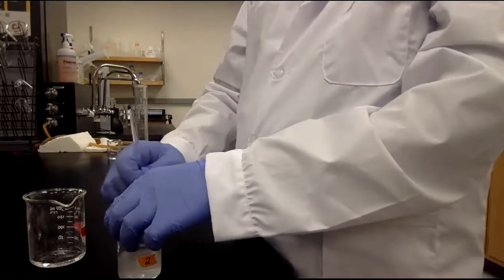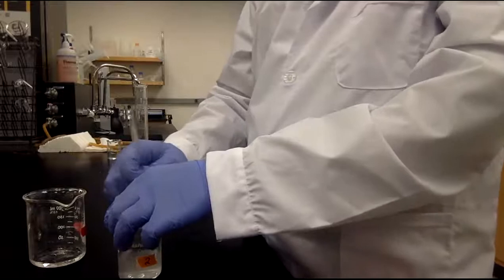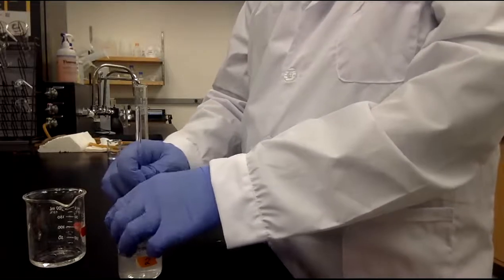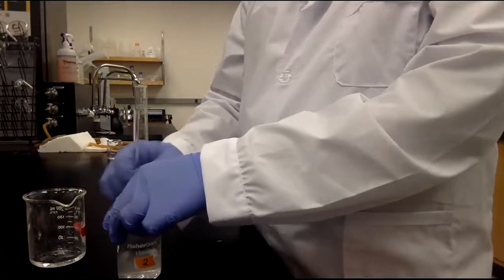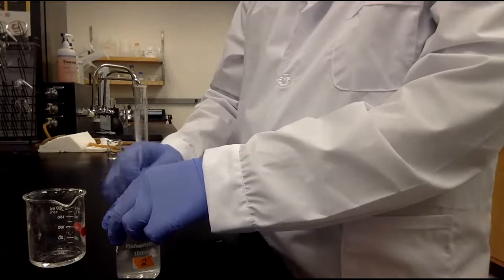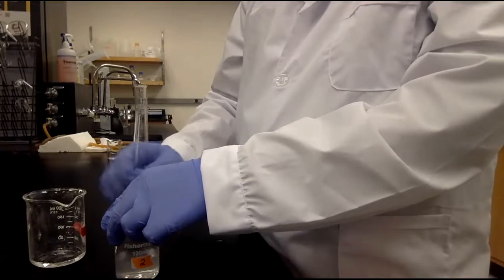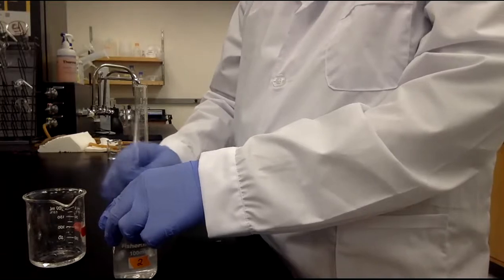You'll be done with part one in like 10 or 20 minutes, right? Because we're almost done with this part. Yes. And then we have to do a part two, right? To figure out the pK2. Part two basically you just add strong base and strong acid to two of the buffers. Then you measure the pH again. That's it. Right, yeah.